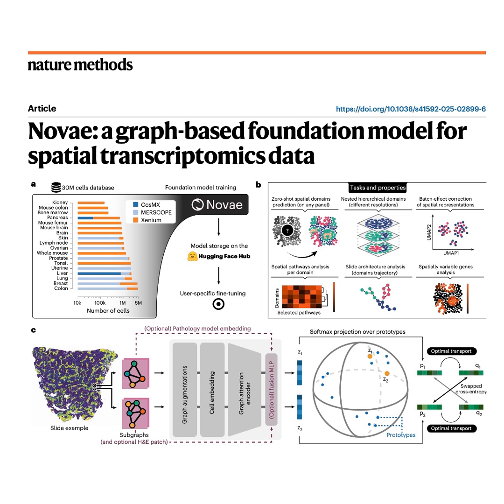So when a user requests a specific number of domains, say 7 overall tissue domains, Novae simply applies hierarchical clustering to the prototypes themselves. So changing the resolution of your analysis, going from, say, 7 domains to 15 highly specific domains, is instantaneous. Essentially, yes, it's constant time. Since the prototypes are already learned and organized, switching resolutions is just a matter of moving up or down this pre-calculated tree. Right, whereas competitors have to rerun those slow clustering algorithms like Leiden every single time. Every time. It's a huge difference.